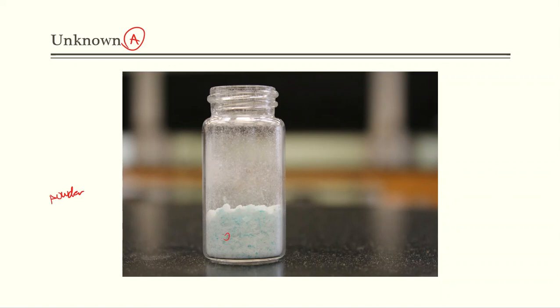You also see these little blue specks inside of the sample. All of those blue specks should not be there. So this sample that we know is benzoic acid should be a very clean benzoic acid sample, but it's dirty. That means that maybe we didn't order the right purity grade when we brought it into the laboratory, or maybe we made this product in a lab, and this is our crude product, is what we call that. So crude, C-R-U-D-E, and that crude product has to be recrystallized so we can make it better.